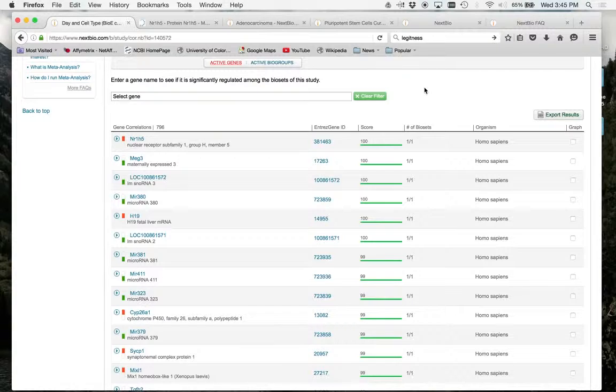You cannot have two things labeled the same, two columns labeled the same. So I think that's what happens. So either pick, and usually it's with the identifier, so pick one or the other. It should recognize AFI too. So if you pick the probe set ID, it should work fine.